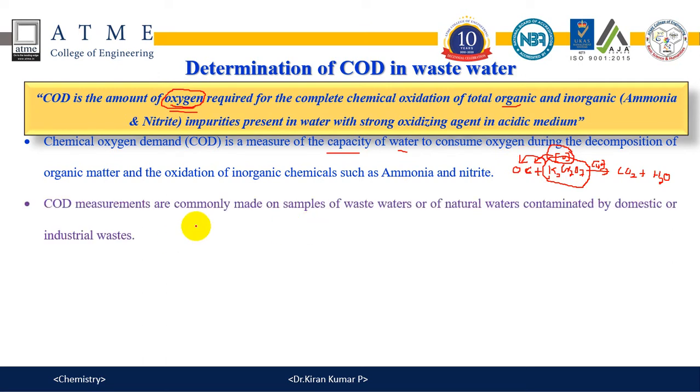So COD is commonly made on natural waters and contaminated water such as domestic water, sewage water or industrial wastewater.